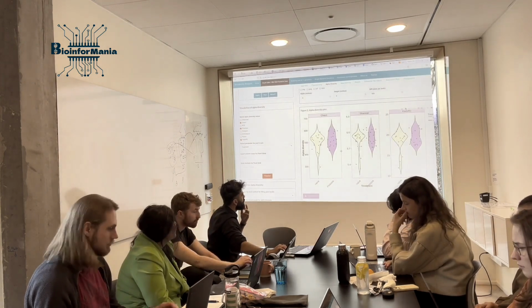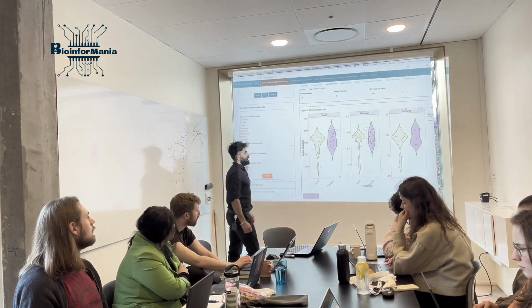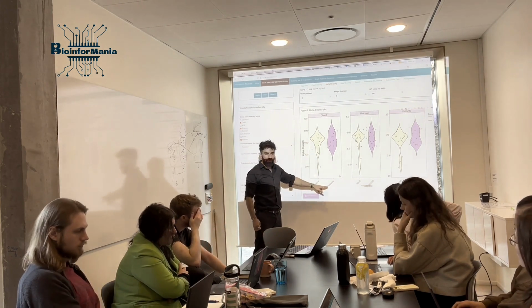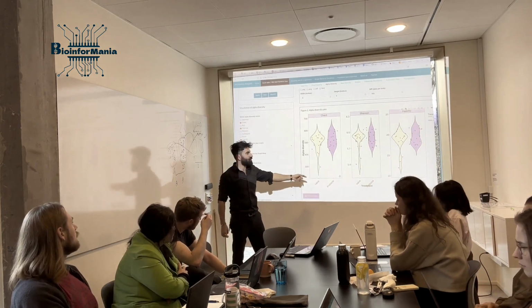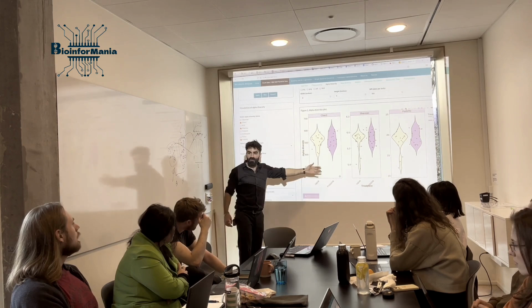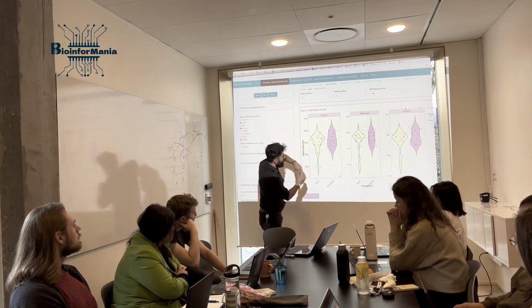Everybody's there? Great. Now you can see that you have three facets, and in these three facets you have two pieces of information. One, the mean of the naive, and for protozoa. Take this as a control group, and this is the challenge group. And then you have this density, they call it a violin plot. It looks like everything but violin, but it's a density. It's good for showing the density of your data, the samples, how densely, how evenly they are distributed for each group.